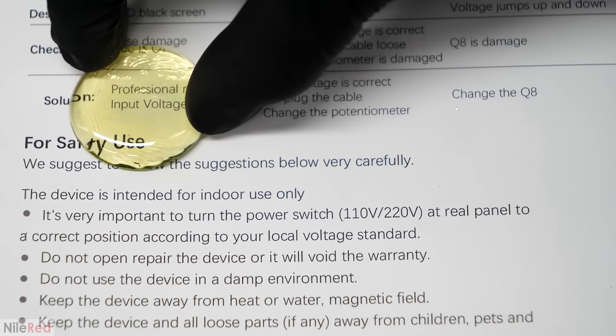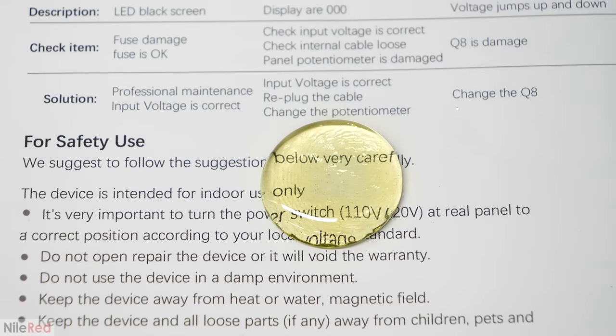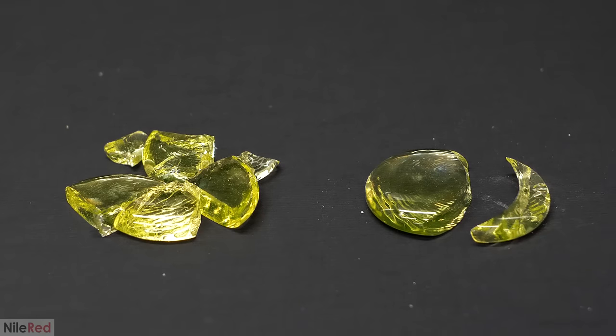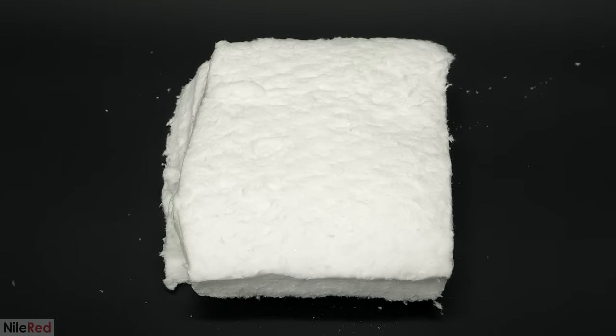Then, almost as though it somehow knew what I was thinking, it responded by splitting in half right when it was sitting in front of me. This was completely random so I unfortunately didn't get it on camera, but this made it clear to me that there was an issue. This was happening because I had cooled down the glass quickly and unevenly, and it had caused a lot of internal stress. What I thought might work to fix this was to just insulate the glass and have it cool down really slowly. The final result would still be under high stress, but I was hoping it would lower it enough just so it would stop spontaneously falling apart.